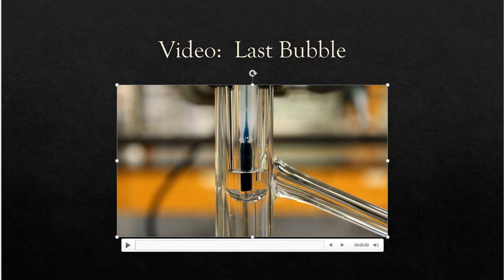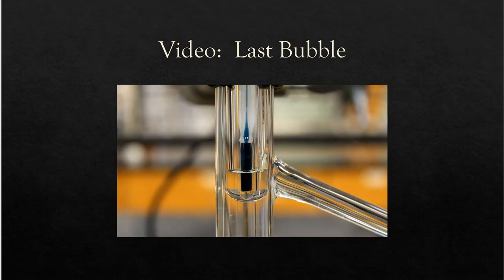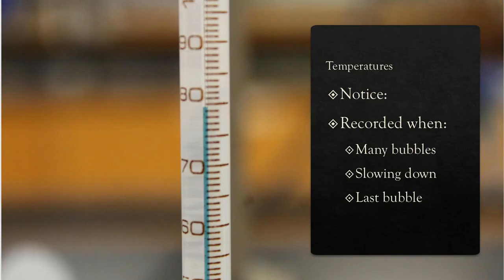As you can tell in that video toward the end, it was starting to suck air back up into the capillary tube, and that's pretty normal. That is what begins to happen toward that boiling point, and that's why the bubbling begins to stop from the capillary. So in this image, this is the temperature at which that very last bubble happened.